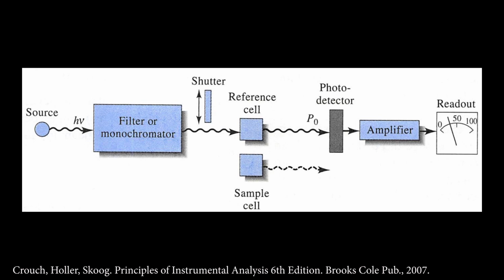And then you switch to 201. Or if you're going to be higher resolution, 200.01 and then 200.02. You're going to scan through the wavelengths. And you're telling the computer each time, okay, this is the maximum light you're going to get at 200 nanometers, 201, 202, 203. And then you've zeroed out the instrument. You've used that blank to tell it what zero was.